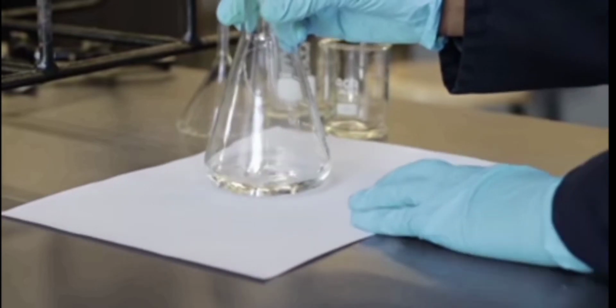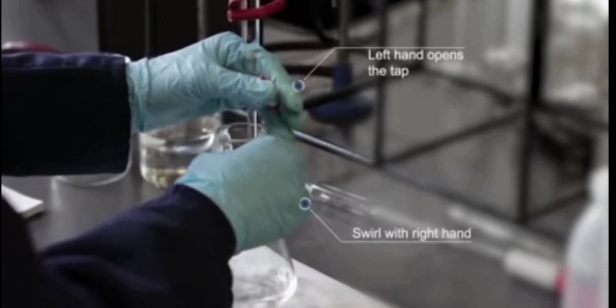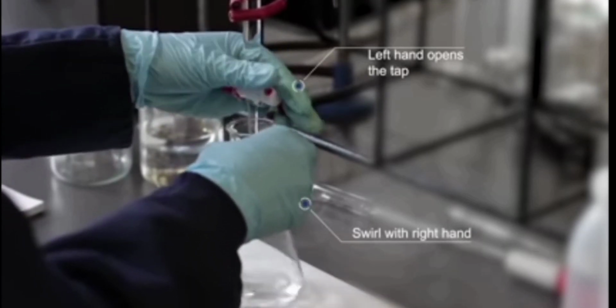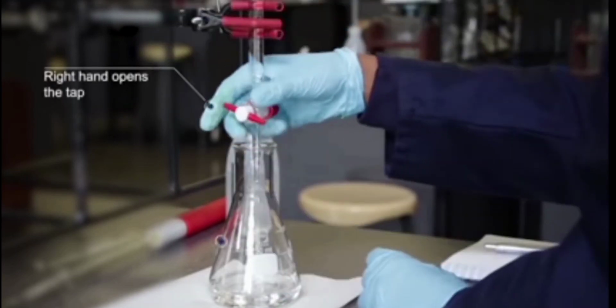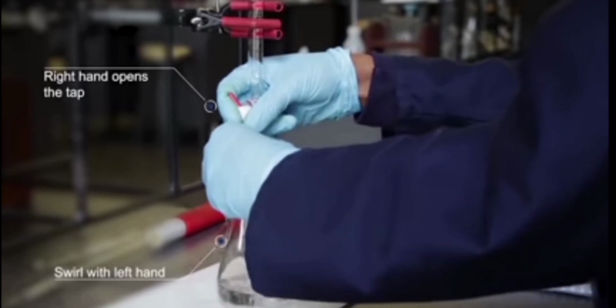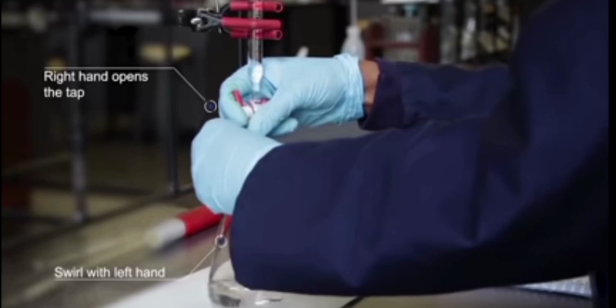To better observe the color change of the indicator, a plain white piece of paper is placed under the conical flask. For right-handed individuals, the burette tap will be handled using your left hand, while the flask is swirled with the right hand. However, for left-handed individuals, the burette tap is handled with the right hand and the flask swirled using the left hand. In this case, left-handed individuals will have to reverse the burette to accommodate their titration.